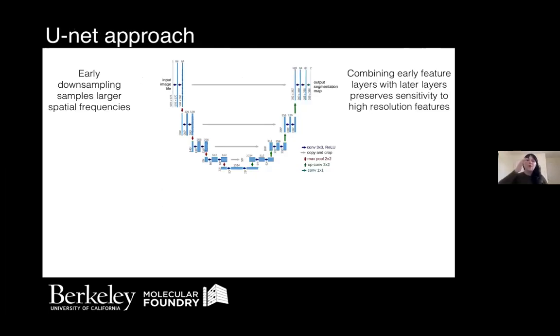Okay, so we decided to use for our first approach a UNet convolutional neural net architecture. In the typical convolutional neural net architecture, we have an encoder and a decoder portion. The encoder portion performs, in addition to the filtering operations, a series of downsampling operations, so our data will get more and more abstracted as we move through the layers of the encoder.